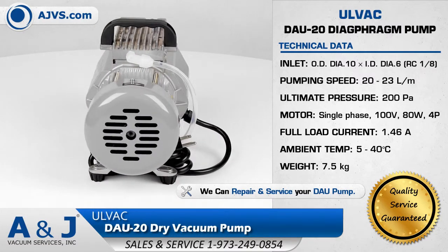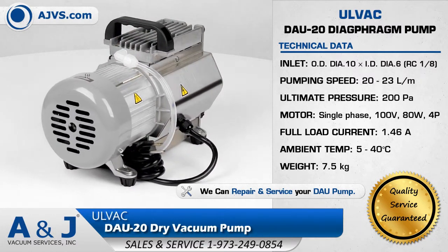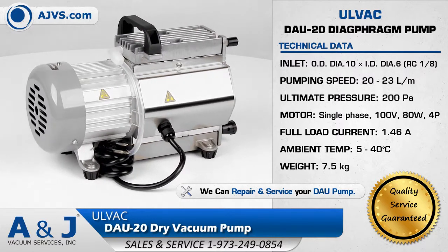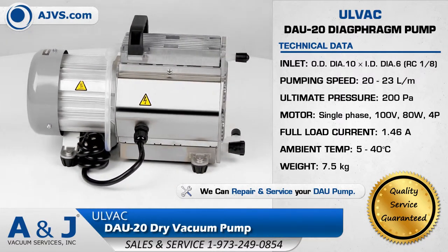The Olvac DAU is completely oil-free and suitable for pumping dry and non-corrosive gases. The Olvac DAU has a pumping speed of 20 liters per minute and operates at low noise levels with minimal vibrations.